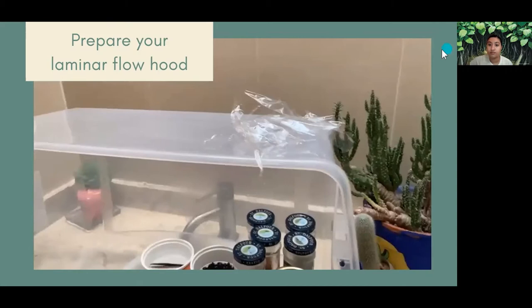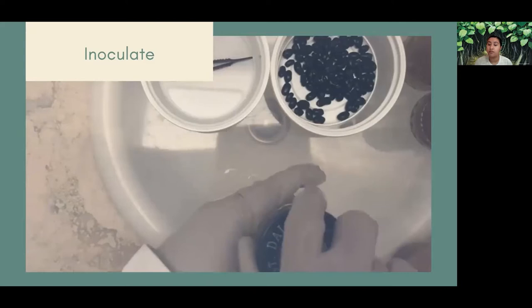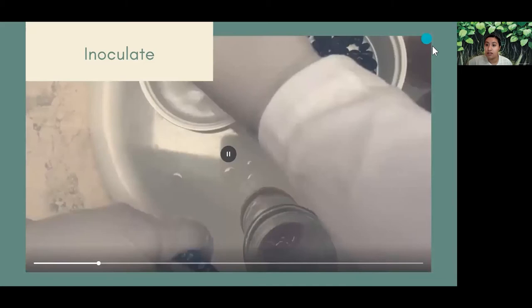Then you are gonna pass to the inoculation part. Please don't take your hands out of the area, and the tweezers, always have them in alcohol, and every time you use them, return them to the alcohol. Please work quickly and always have the lid there to close to avoid contamination.